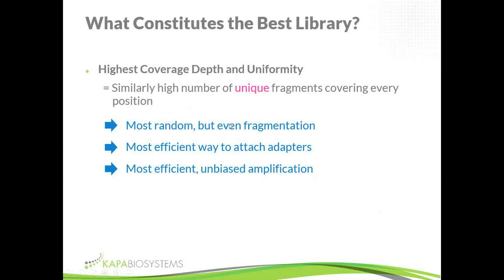What is the most efficient way to attach the adapters? That helps us determine how much of the DNA that we have in the beginning we are able to convert to adapter ligated library. And we talk about the diversity or the complexity of the library, and that ultimately again determines how many unique fragments we have covering every position.